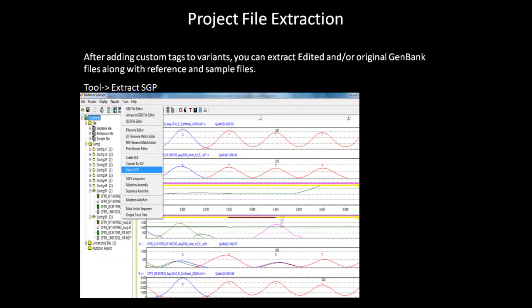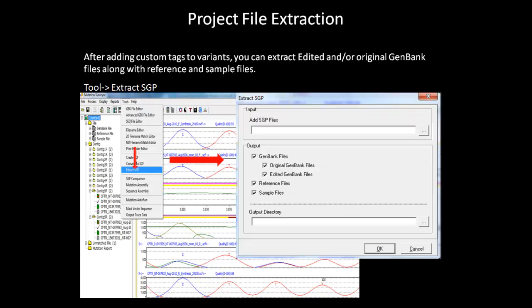The final part of the webinar will touch on the project file extraction tool, or extract SGP as it is called in mutation surveyor. Mutation surveyor keeps two copies of the GenBank file: one original used for the analysis and an edited GenBank file that contains additional custom tags added by you. The SGP extraction can be accessed from the tools tab under the main menu, and is basically a tool to extract components from the saved project file. You must choose the project file in the input field, choose the desired component to be extracted, and specify an output directory. The dialog box has options to extract the original GenBank file, the edited GenBank file, or both. These components can be saved for future reference.